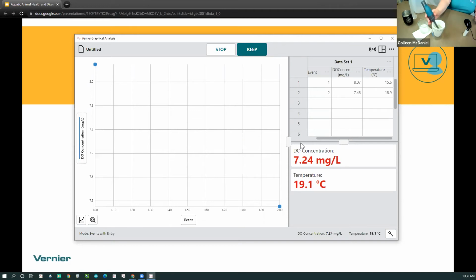And do a measurement. And you can see with my optical dissolved oxygen probe, I don't have to worry about putting it back in water to store it between readings. It's really stable outside of a humid environment, which is nice. So for short-term intermediate use with a lab like this, the students can just lay it on the table and just kind of use it as is. If you have a regular dissolved oxygen probe that requires filling solution, for example, that one does need to be placed and stored in water between each of these data points we're collecting.